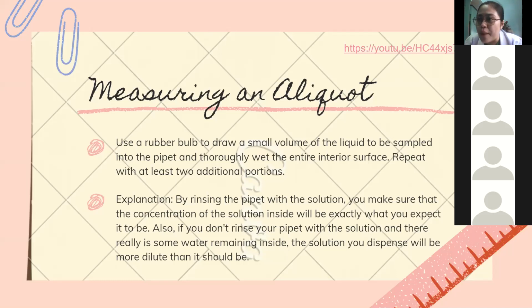I-calibrate na to ang atuang pipette na kung whatever is the concentration of the solution na ginagamit, maupod ang concentration inside kasi nakalibrate ang atuang pipette to carry that certain solution.